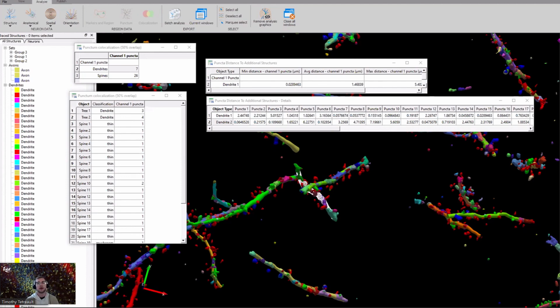It's going to be a little bit difficult, but I think as long as the edges are saturated, I don't want to promise that you'll be able to get the full detection. I think you should be able to get it. You may have to increase the detector sensitivity and make sure that whatever your detector diameter is truly encompasses the whole mass. But I believe you should be able to do that.